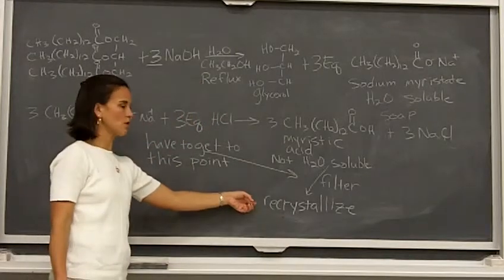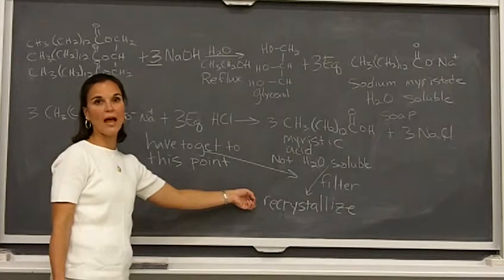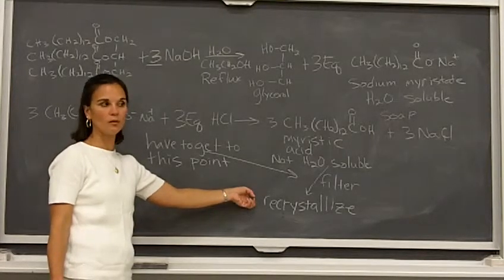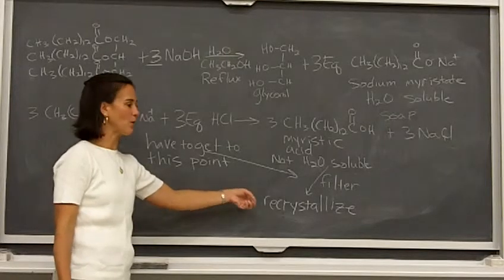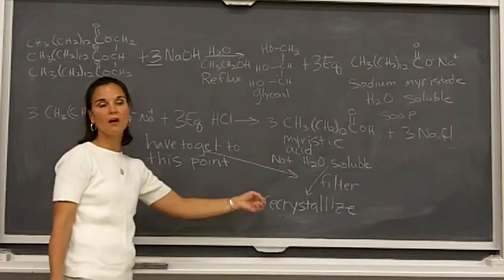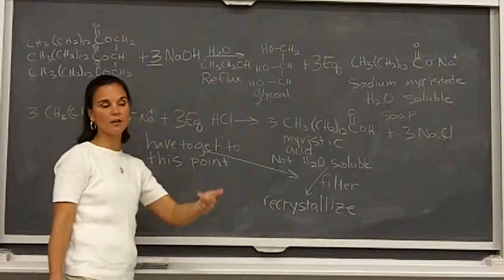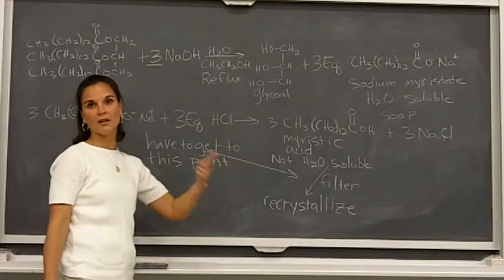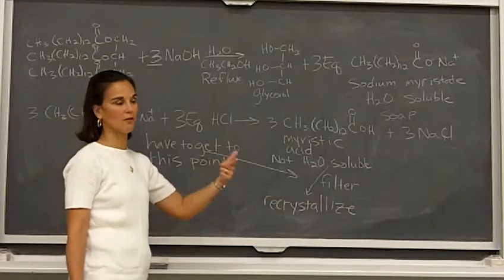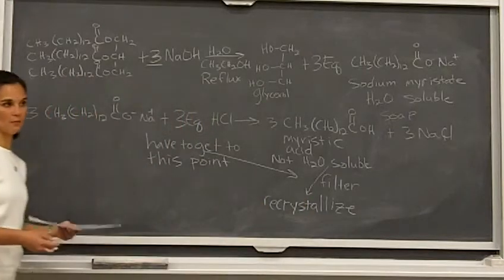Otherwise, this recrystallization, you could do in open lab. Just make sure that your lab prof knows when you're doing it and you've arranged a time that they're available to know that you're in the lab. And you have to have a buddy with you, okay? So it's not like melting points where you can go in on your own. If you're going to do the recrystallization, you have to let your lab prof know. You have to have a buddy with you that is dressed properly for lab, whether it's another organic lab student or not. But they have to go into open lab with you, okay?